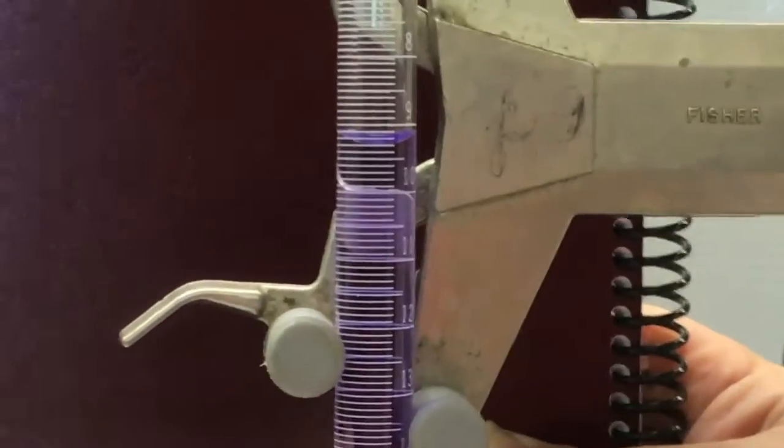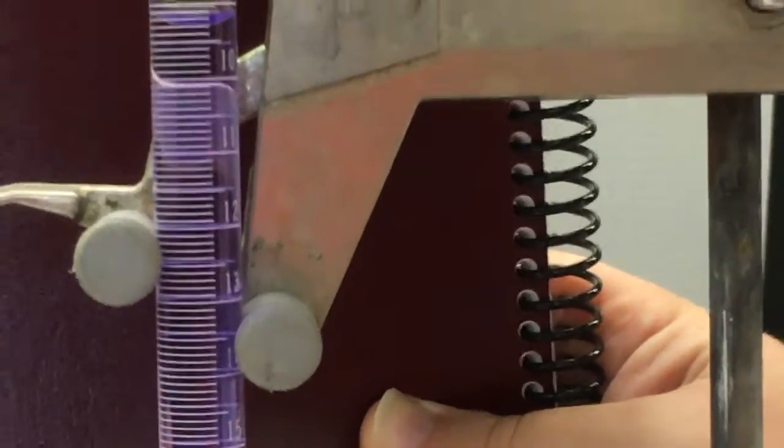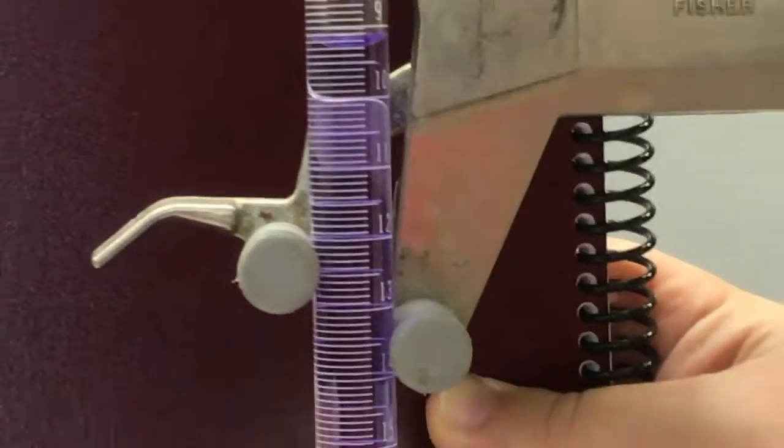Now remember the rules about significant figures. You always estimate the last digit. So looking at the gradations here, you would read this instrument to the hundredths place for milliliters. That is, you grade it down to the tenths place, 0.1 milliliters. You read it to 0.01.